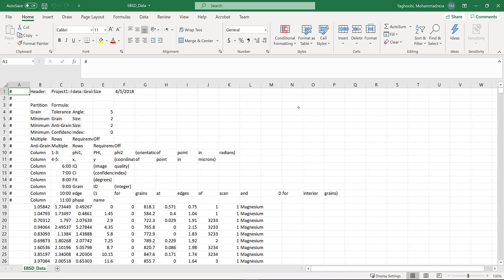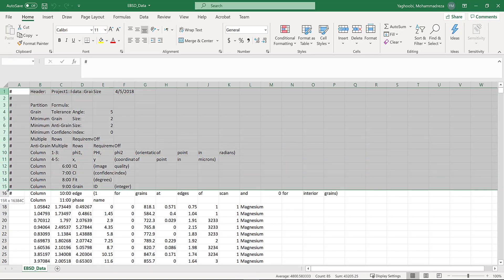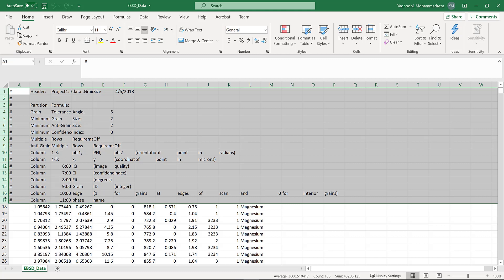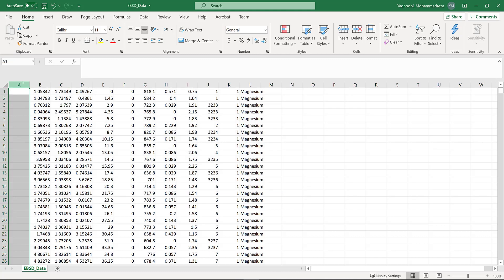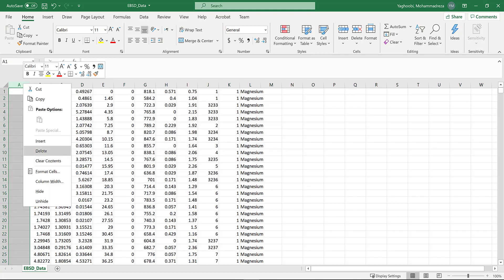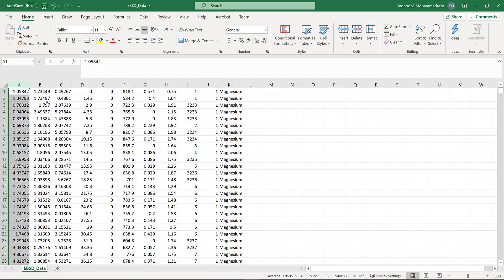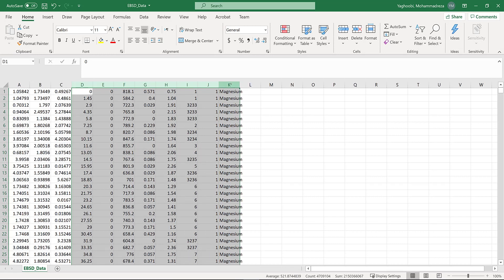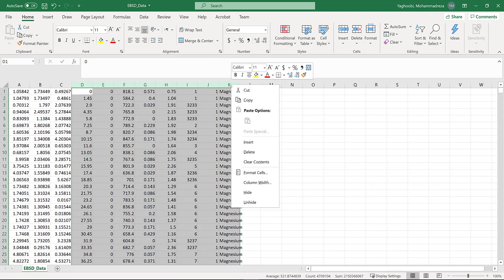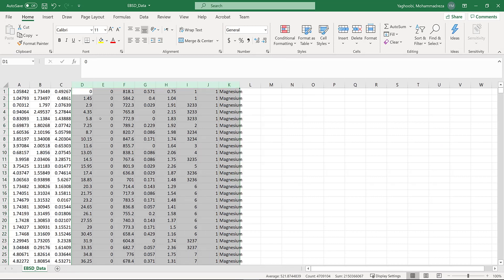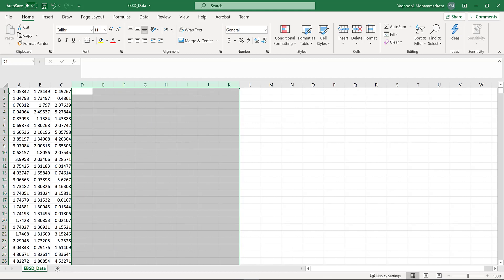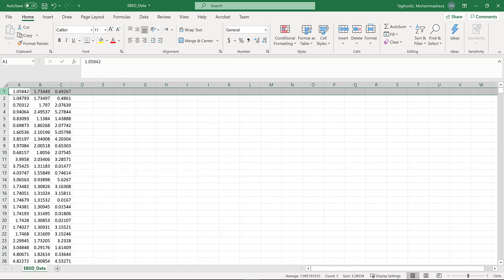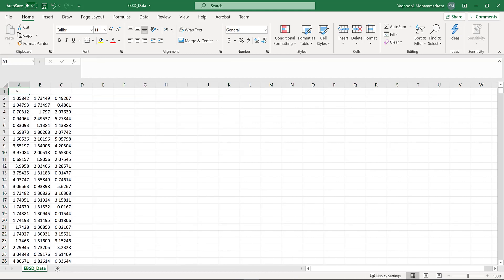What you need to do is remove all these rows, delete the first column, and remove all the columns except the three related to orientations. Then you need to add one row and put 'angle count' here.